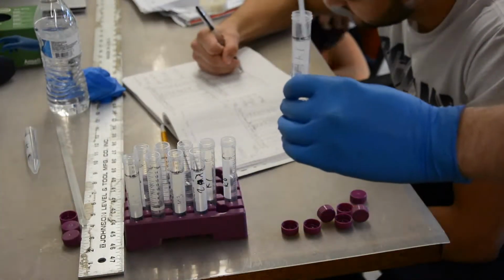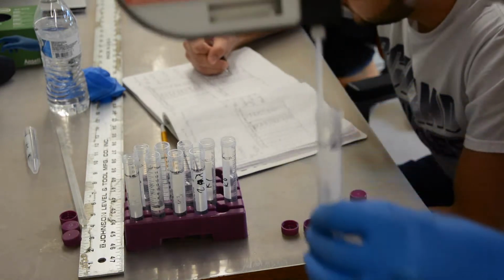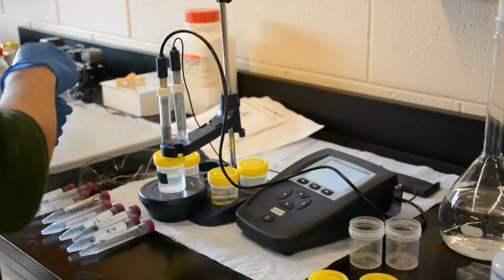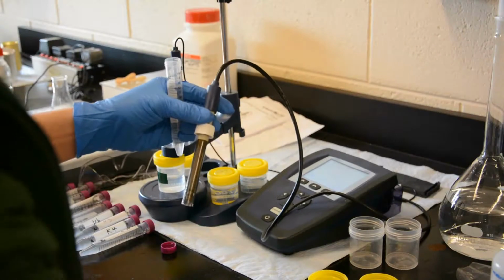10th, determine the density of the raffinate, kerosene, with the density meter. 11th, determine the conductivity of the extract, water and acetic acid, with the conductivity meter.